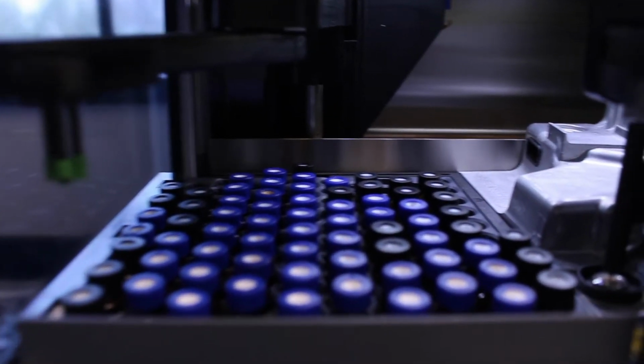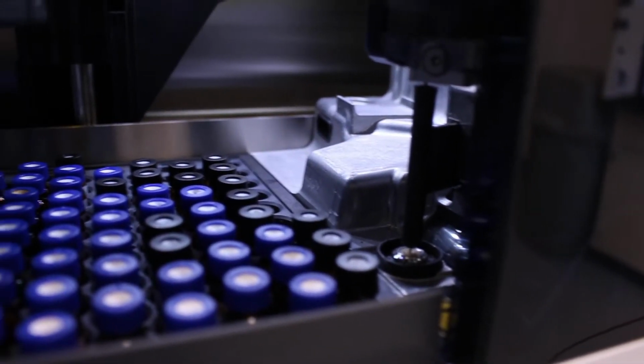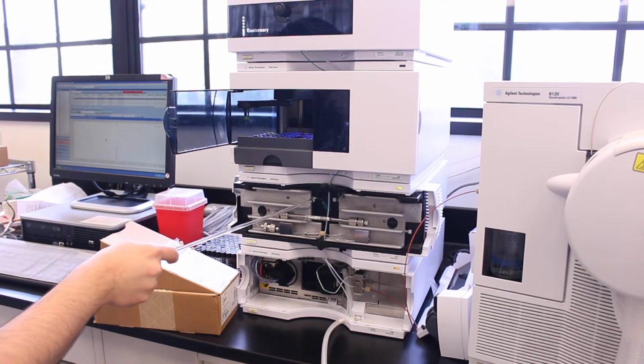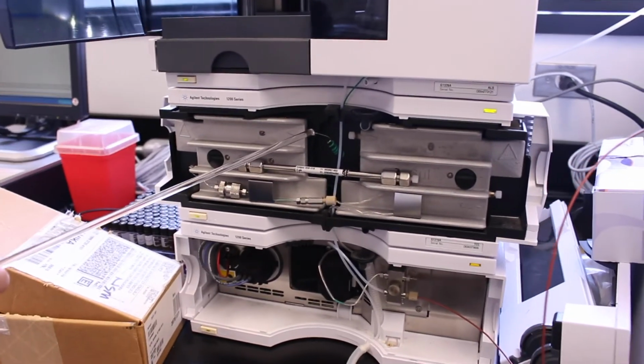So it has a needle in it, and it draws up some of the sample, and then it's going to inject it. It's not very easy to see, but there's a little plate here where it injects it into the fittings here, into the piping. Here's the little capillary tube where the mixture travels through. You can see it's very thin.